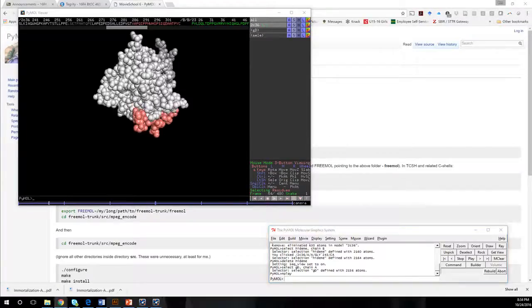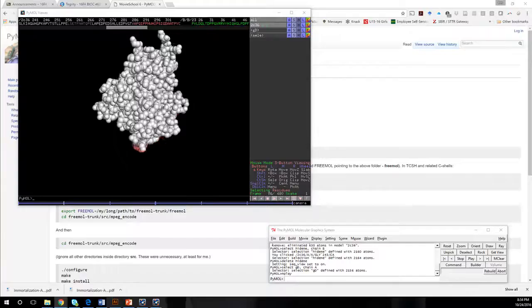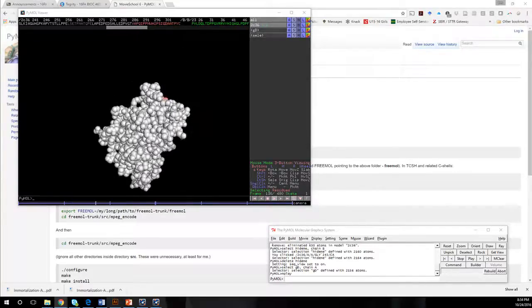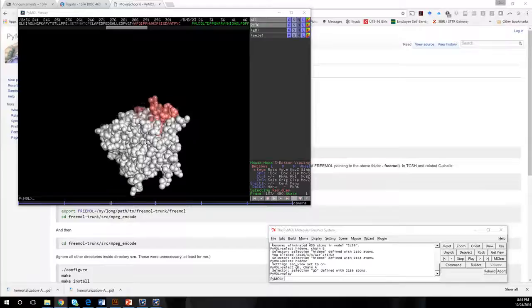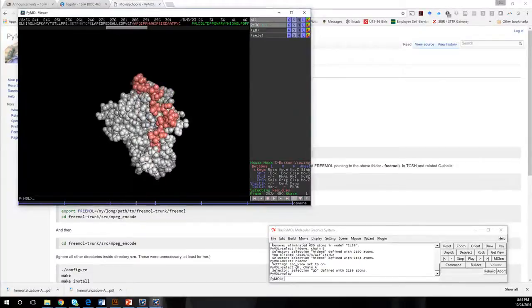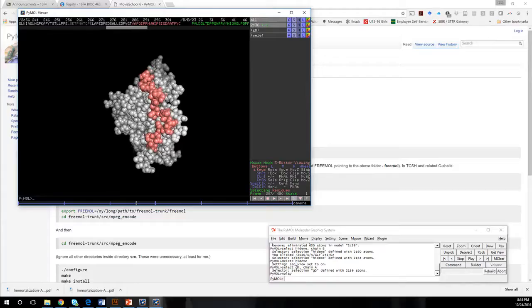Okay, so in the example they also give you how to do rocking, and they show you how to nutate and all sorts of other things. So now I'm going to work on... Before I do any other work, I want to stop the movie.